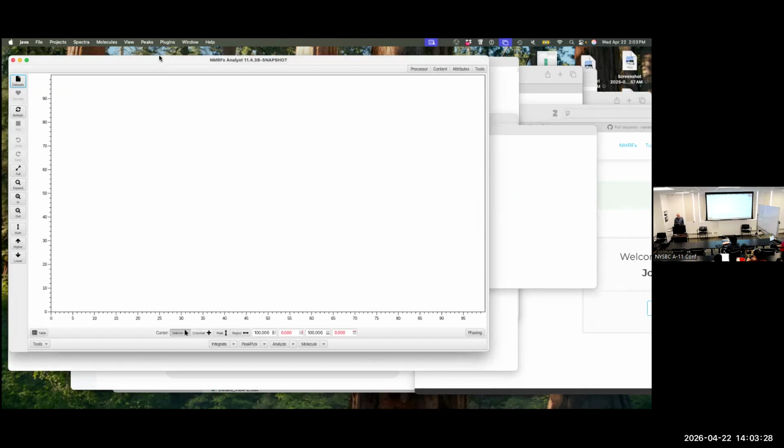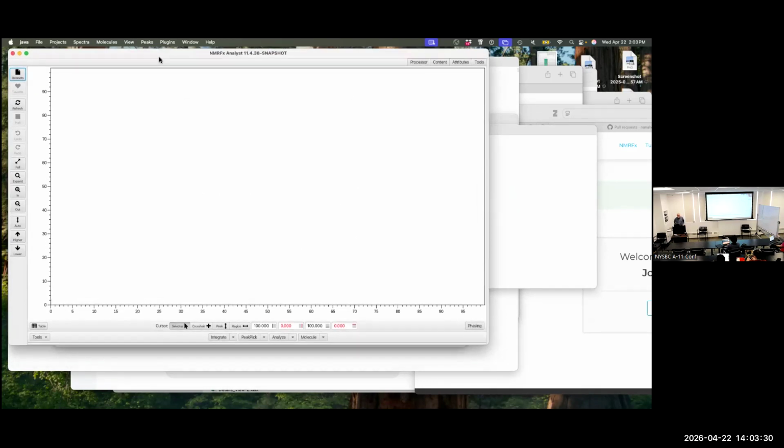One advantage of doing that is sometimes we want to start multiple copies of the software. In the command line, you can actually start multiple copies and get them going. You actually have separate instances running at the same time. If you double click in the applications folder, it will always just start one. Okay, so we've got it started.